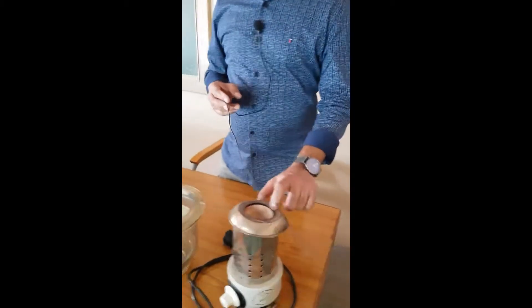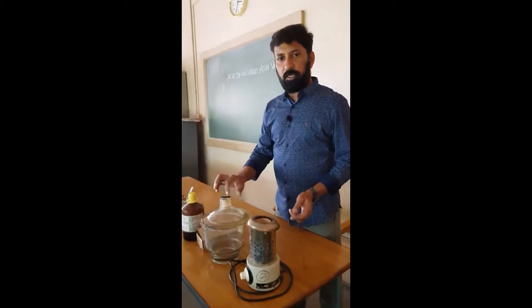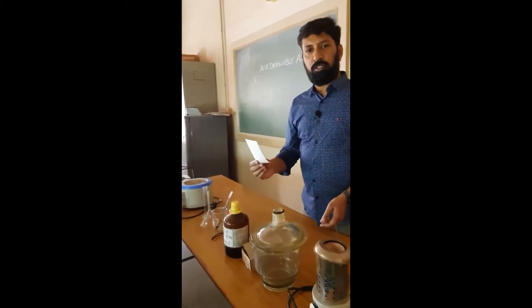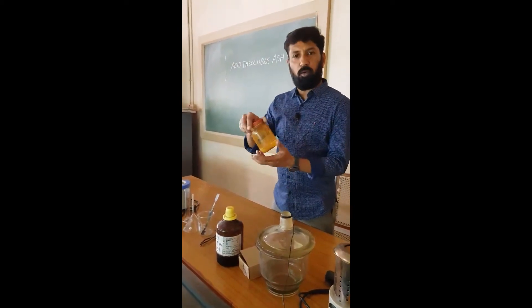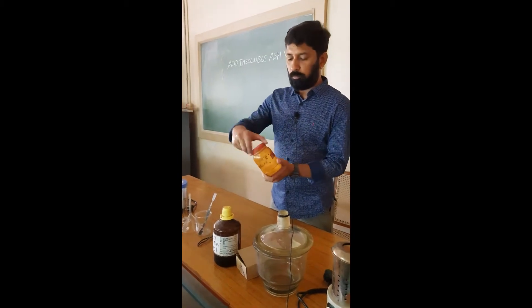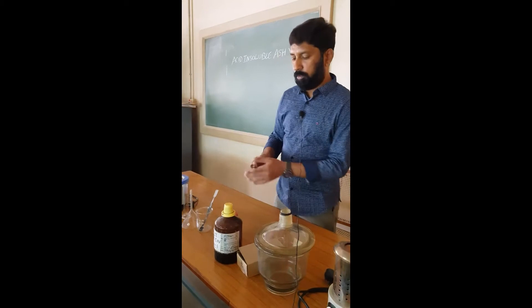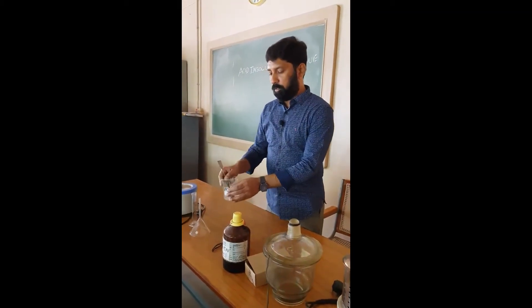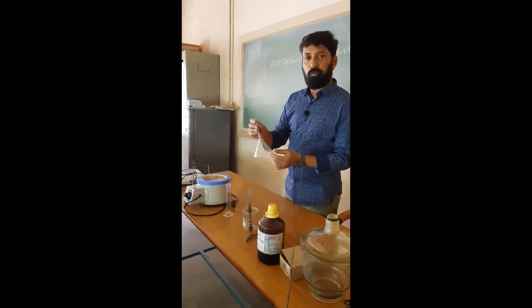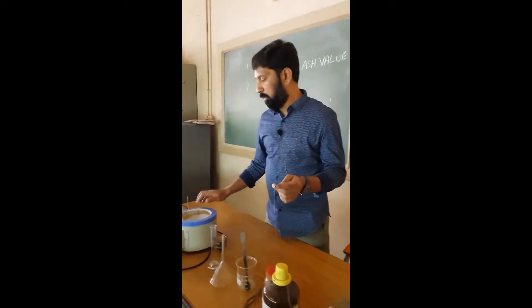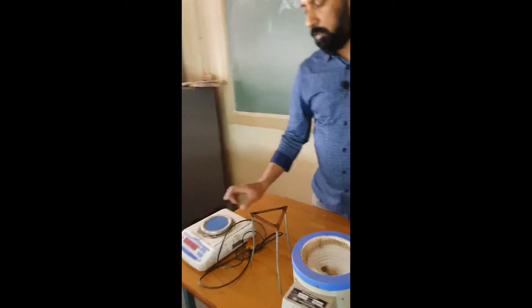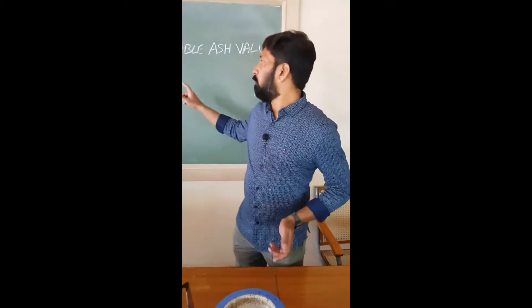The requirements for the acid insoluble ash value: first we need an incinerator, desiccator, ashless filter paper, dilute hydrochloric acid. The drug used is liquorice — it is a powder drug. Also needed: tongs, beaker, spatula, funnel, measuring cylinder, mantle, tripod stand, and electronic balance. These are the requirements for doing the acid insoluble ash value.